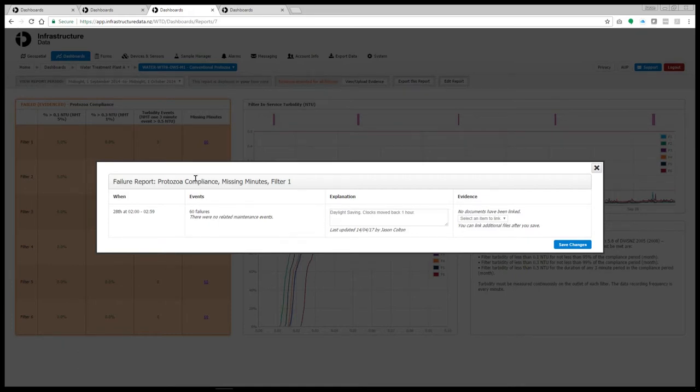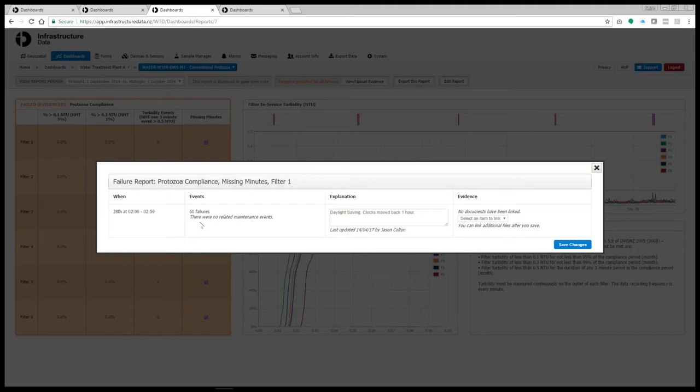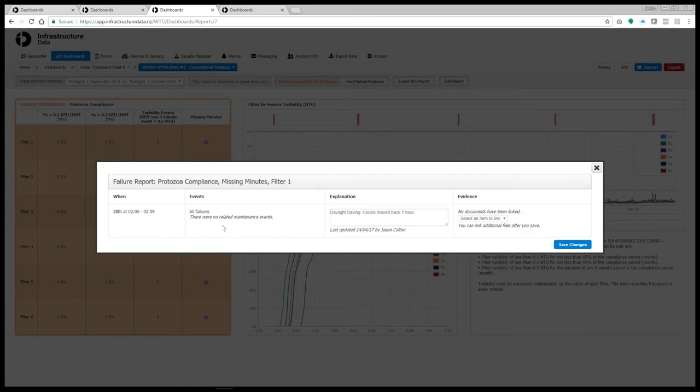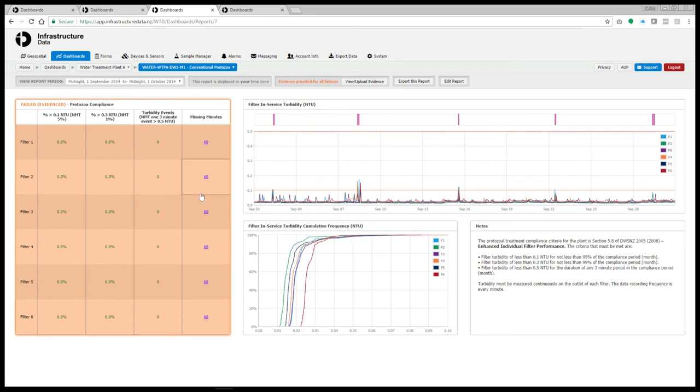Now this is a great way of collating your exception reports. For example if a 3 minute event occurs and it happened at the same time when a maintenance activity on your turbidity meter occurred, this will automatically be pulled in here. So you don't need to go looking for those records. So that saves a huge amount of time. And it organizes the data and your exception reports into one place which makes it easy for you and it also makes it easy for your drinking water assessor.